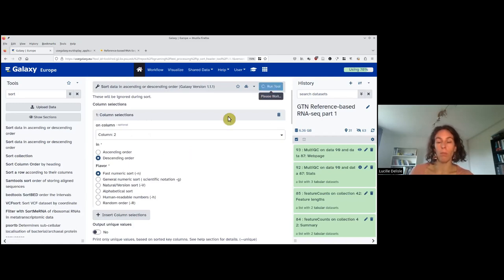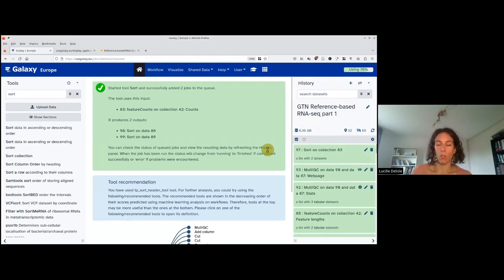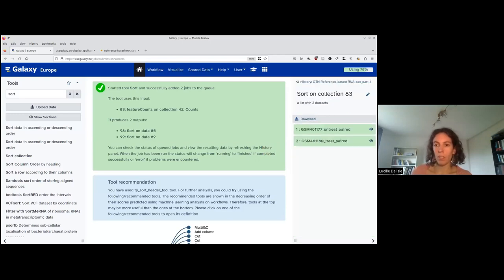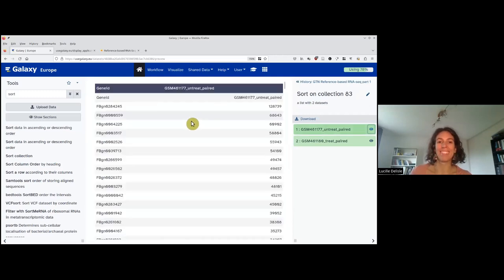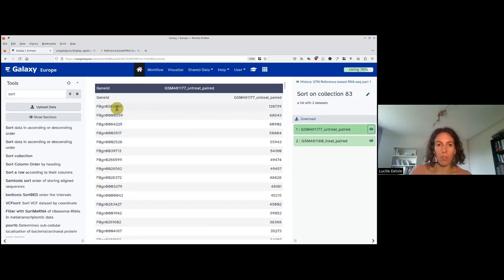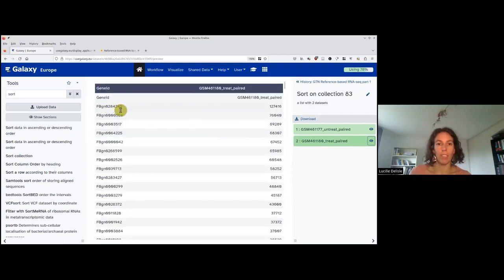We leave everything by default and run the tool. The sort tool finished. I can click here to see the result. If I select dataset 77, it's going to preview. We can see that the top one is 28,4,2,4,5. If we check the second one, it's the same.